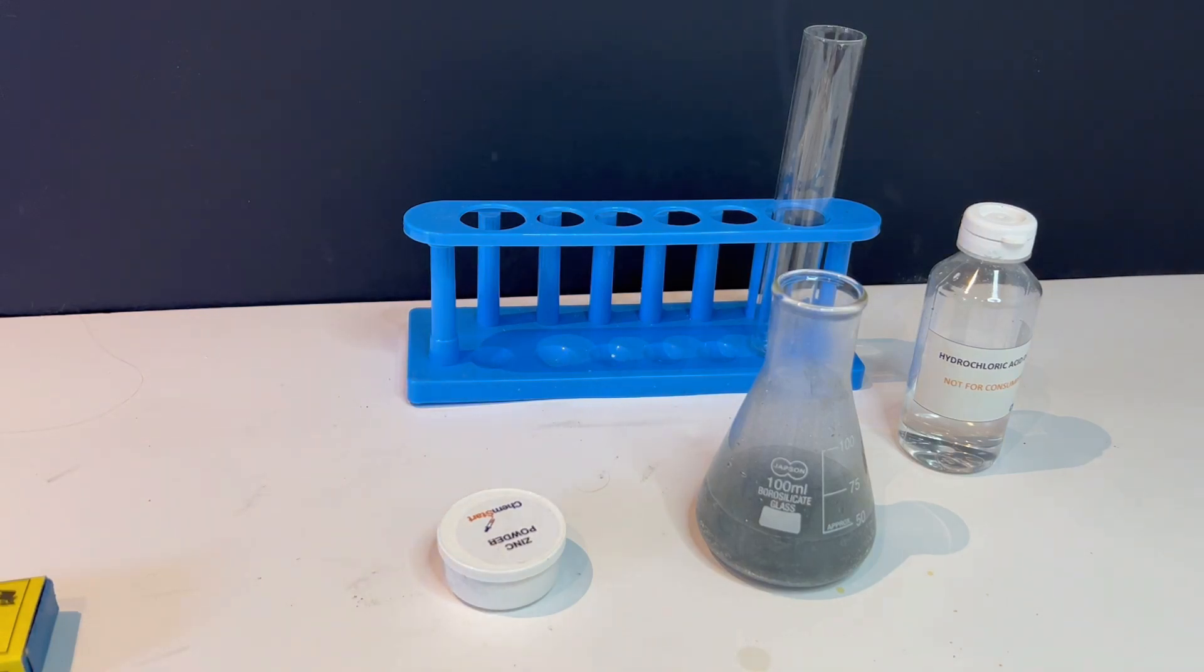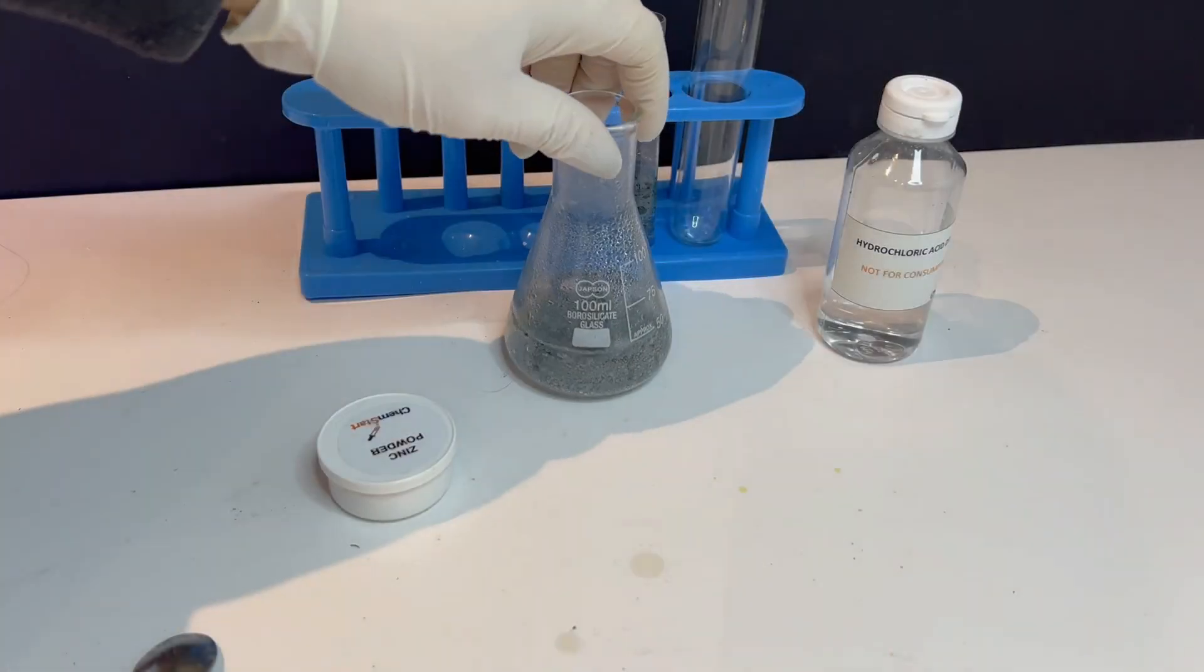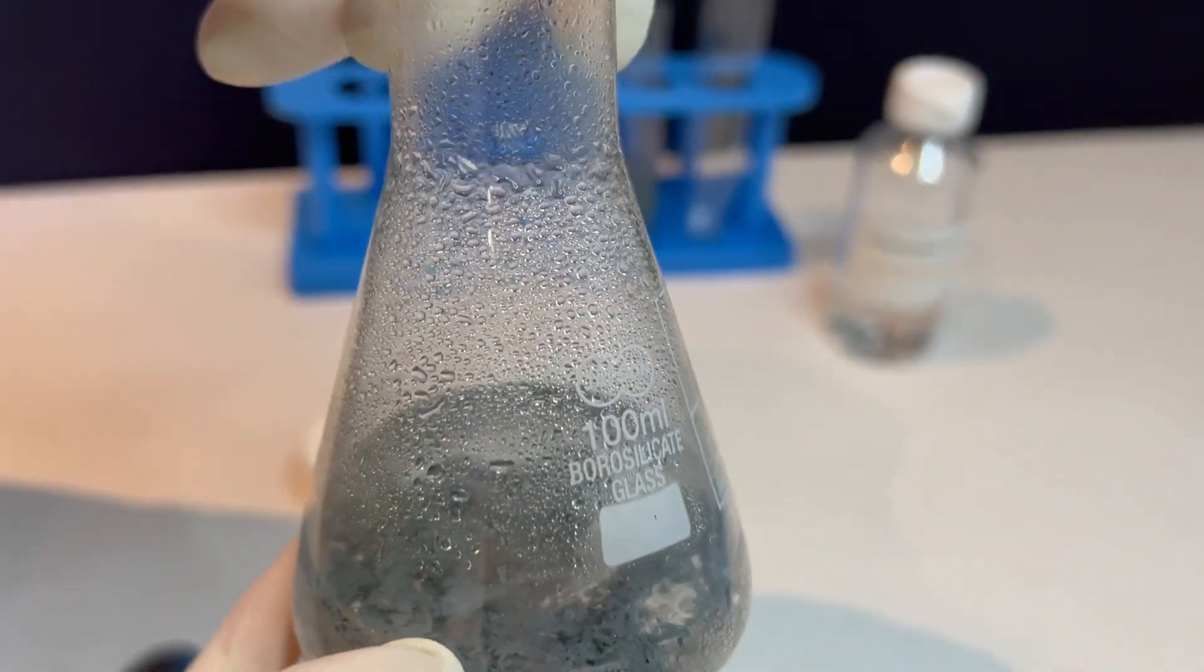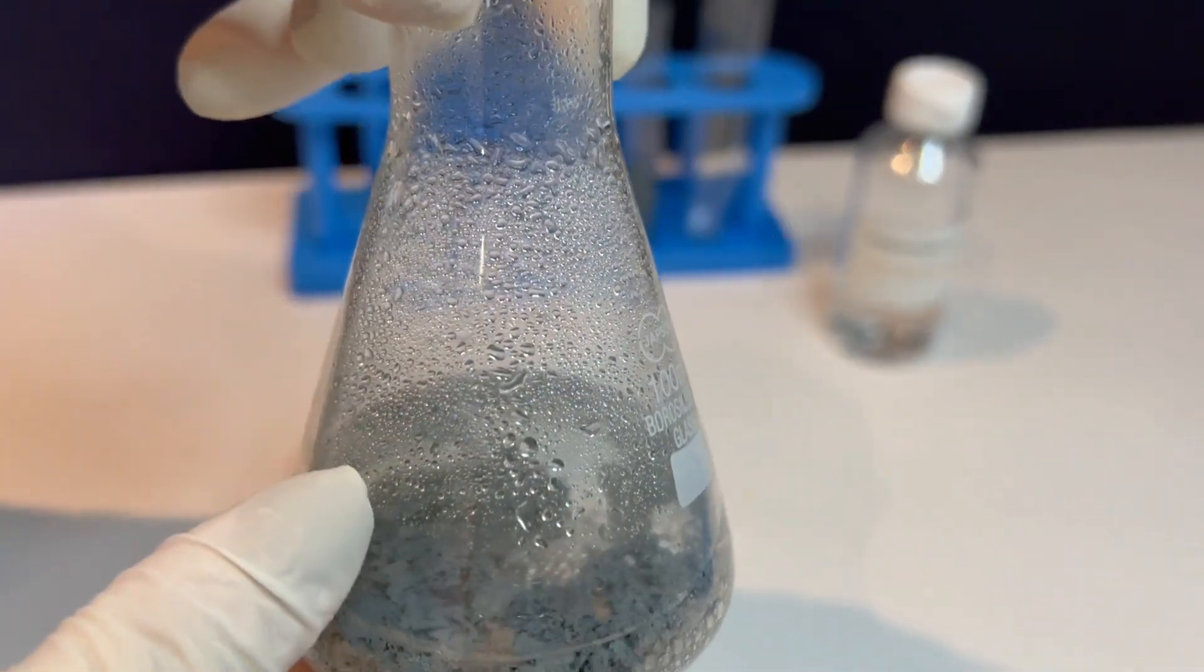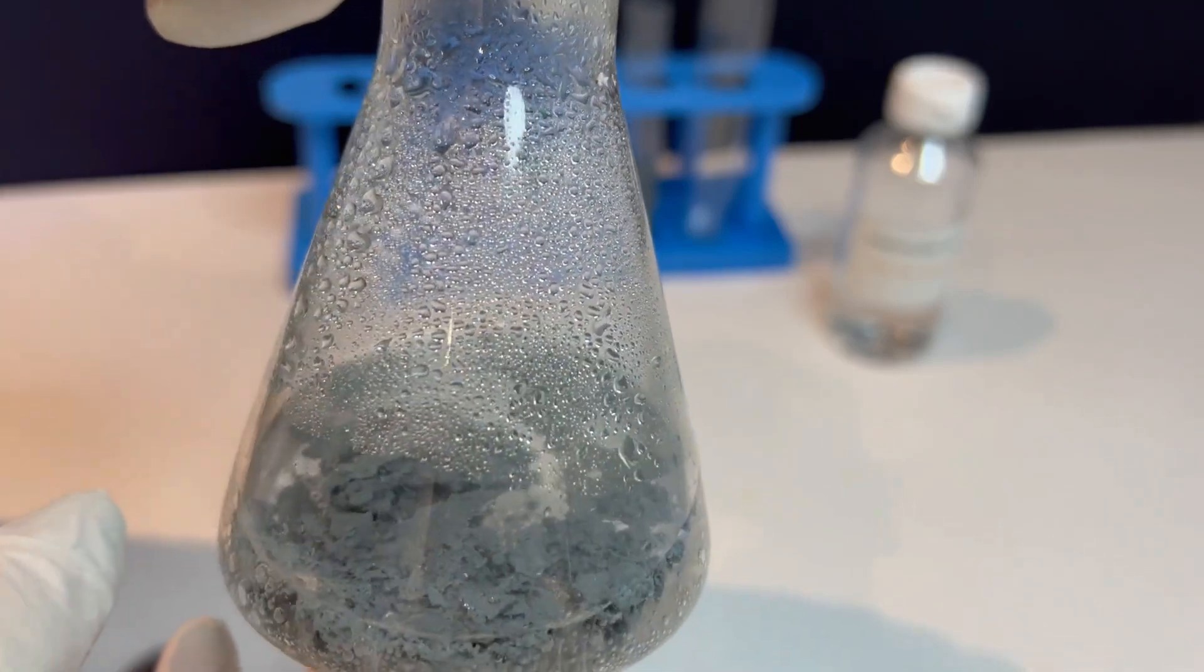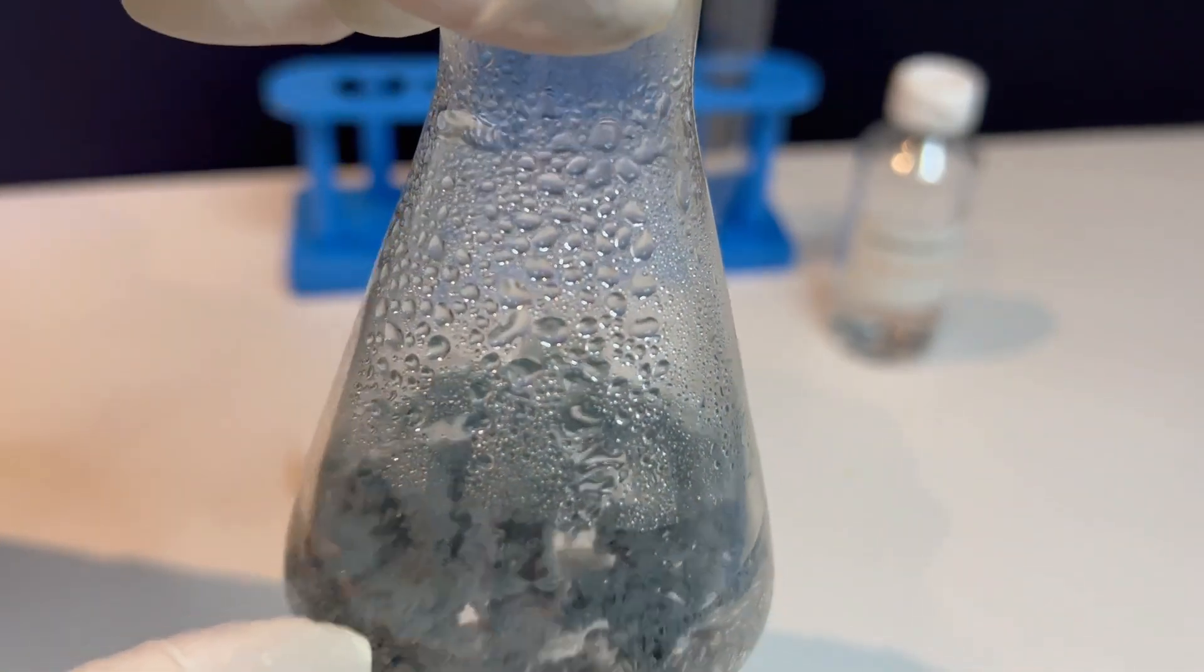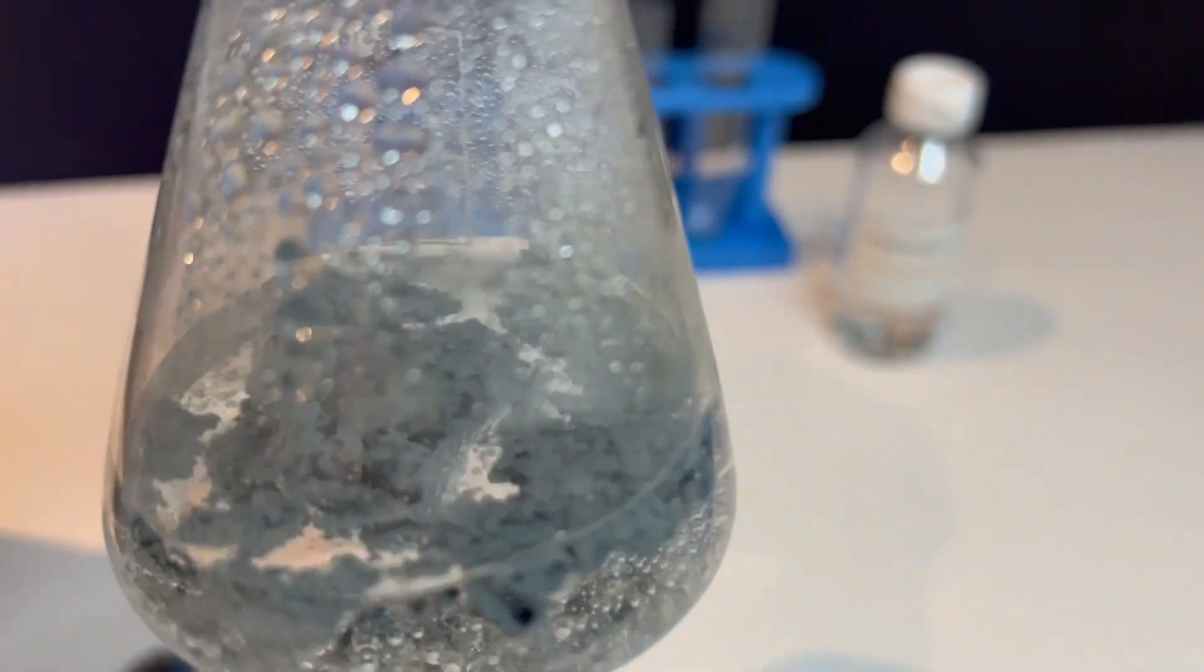So what did we learn? When zinc powder reacts with dilute hydrochloric acid, it produces hydrogen gas, and we can confirm this using a simple flame test. This experiment is a great way to observe a single displacement reaction, test for hydrogen gas, and practice safe chemical handling.